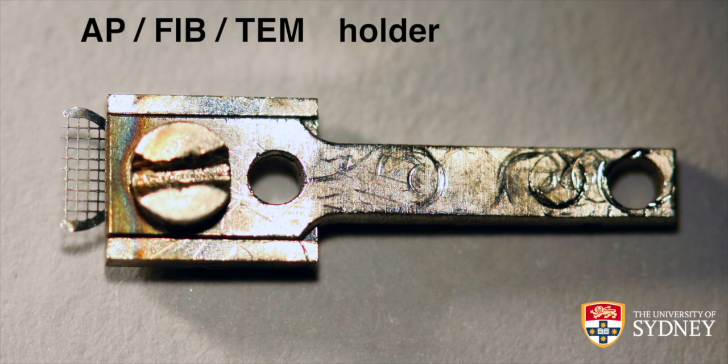And also we can put the support structure in a variety of different ways, which will come in handy for some of the other lift out things that we're going to be doing. If you want to use these holders yourself, you're welcome to make some of them. The design is published in the publication you'll find at the end of this video, or you can try to get some from us. The holders, if you want to do TEM on them, only fit into JEOL TEMs, they don't fit into FEI TEMs. FEI TEMs generally have very slim holders, so it's a little bit difficult to make any attachments to them.